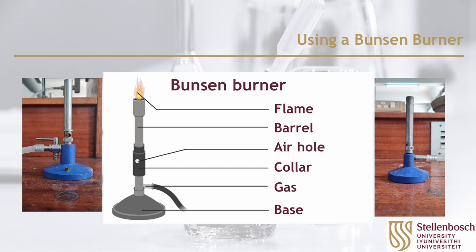The burners consist of an air hole collar, a barrel, and a base to which tubing is connected. There are two types of Bunsen burners in the first year labs, so pay close attention to both procedures.